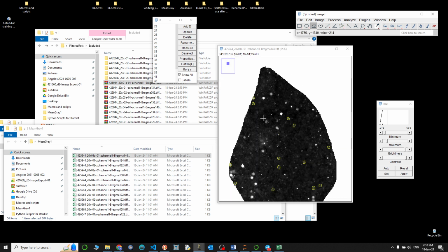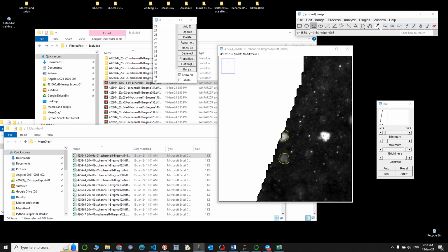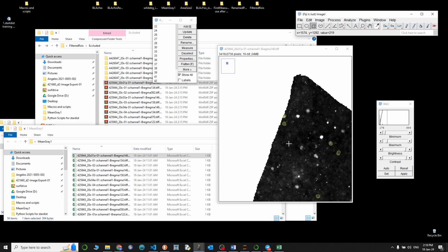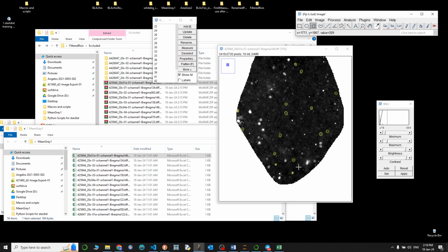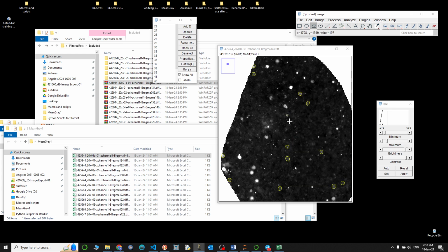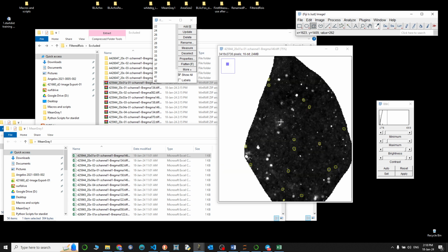And there are other ones that I'm not exactly sure why they've been excluded, like that. Probably these pixels here create an issue. I'm not sure. But in any case, don't worry about the exclusions, because you will be able to bring the exclusions back. Again, right now I'm doing it quite hastily, so there is something going on that I have to think of.